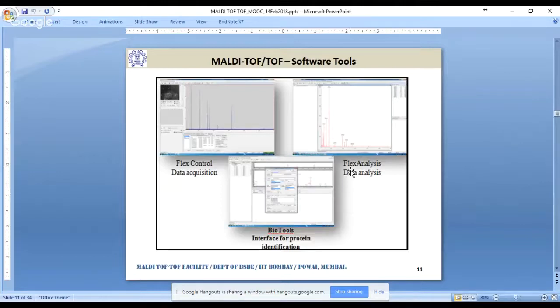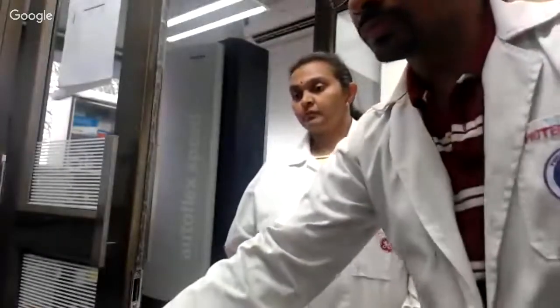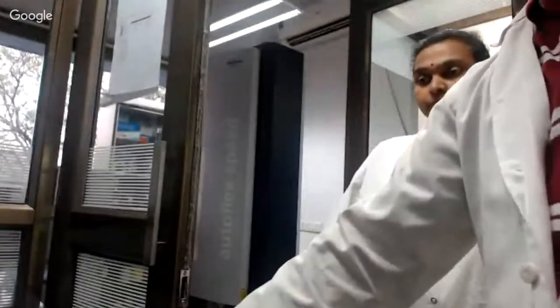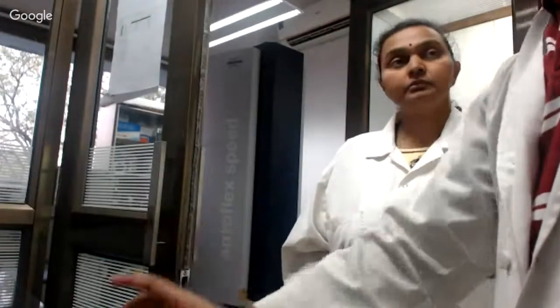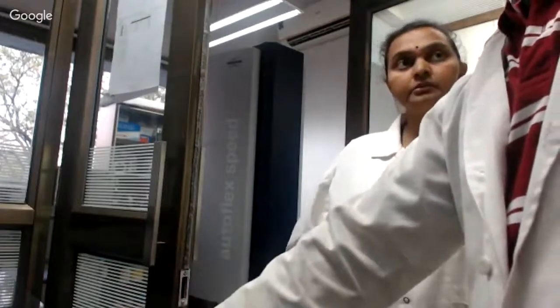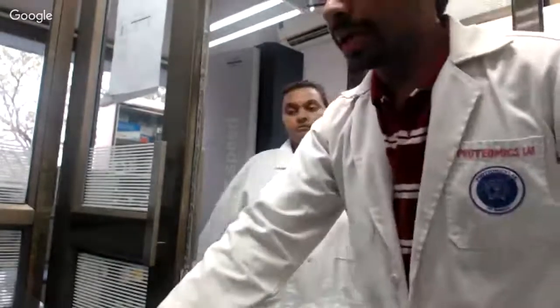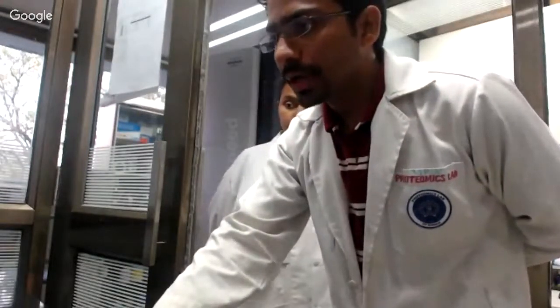We will now have a brief demo of the Flex analysis. So here, after acquiring the data, we'll go through the analysis.